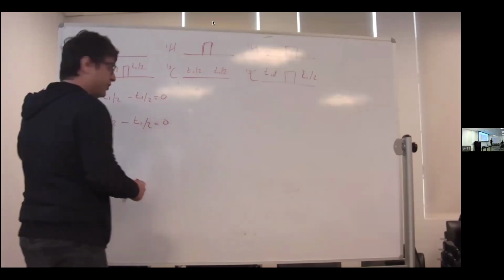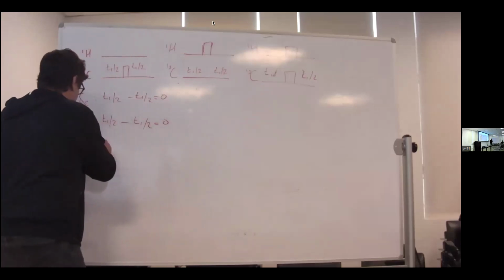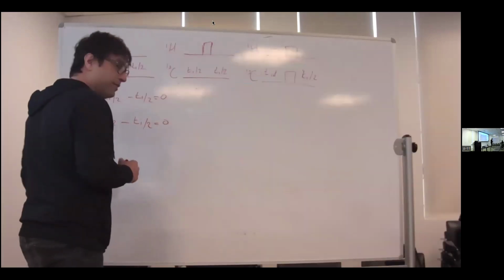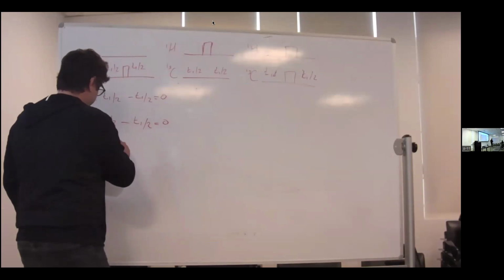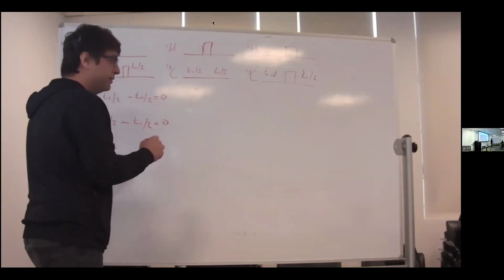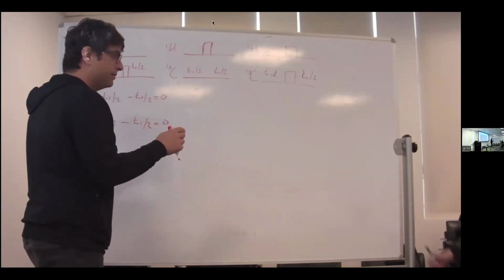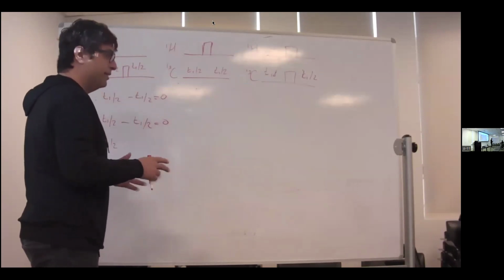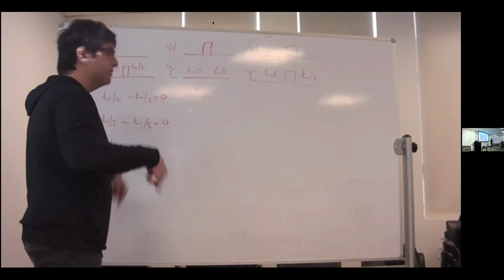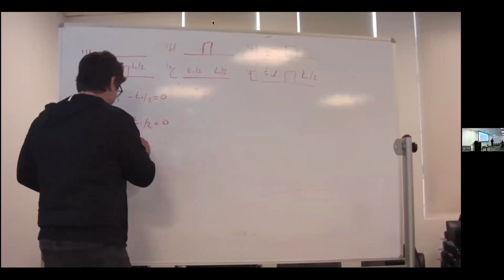But let's continue. What else do we have besides CH couplings? CC. Okay, so now what is the carbon-carbon coupling? How does that evolve? t1 over 2 plus... Why are you adding? Because they both split, so minus. Why are they both flipping? Because it is not selective. So let's assume this is a hard enough 180 that it hits both carbons. Then it's a double negative, so you add it there. Oh, so that's interesting. So that evolves for t1.